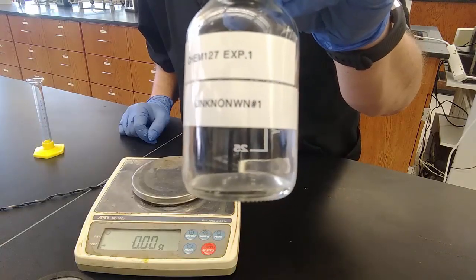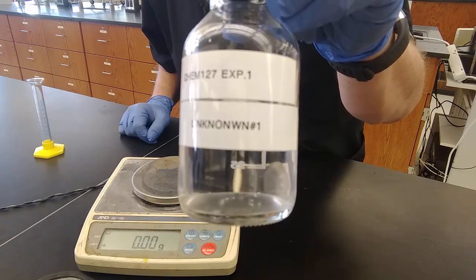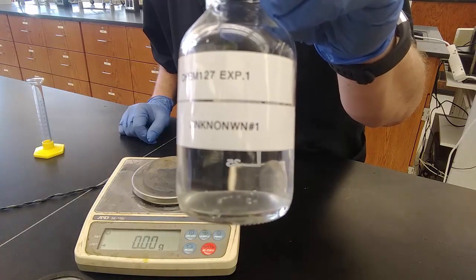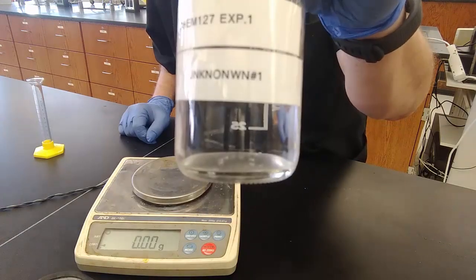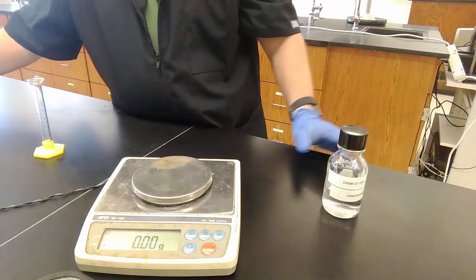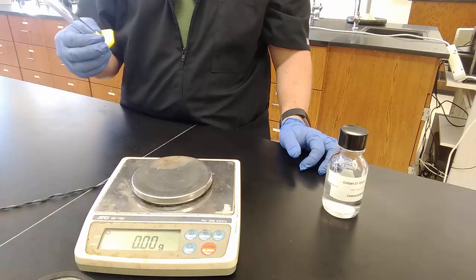Again, there's a data file that your instructor has access to that has a variety of different unknowns listed, but if your instructor is having you just write down the data that we're recording here, we have unknown number 1. So, it says, step 2, weigh an empty 10 milliliter graduated cylinder.